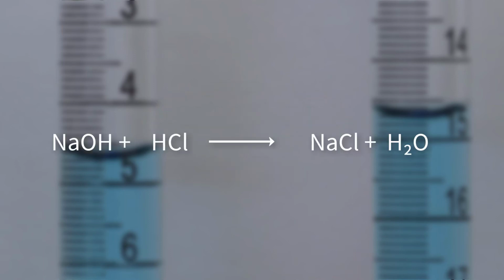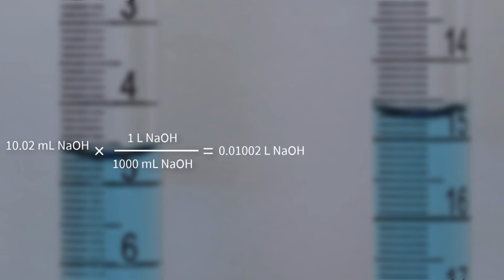The titration data will be used to calculate the number of moles of acid in the solution. To do that, we need the balanced chemical equation to give us the stoichiometric ratio. For the reaction between sodium hydroxide, the titrant, and hydrochloric acid, the analyte, the stoichiometric ratio is 1:1. For every mole of sodium hydroxide added to the flask, it reacts with a mole of hydrochloric acid. From the burette reading, we added 10.02 milliliters of sodium hydroxide. Because of limited screen space, we will have to break this calculation up, but it could be completed in a single line. The next goal is to determine how many moles of sodium hydroxide Lloyd added to the flask.